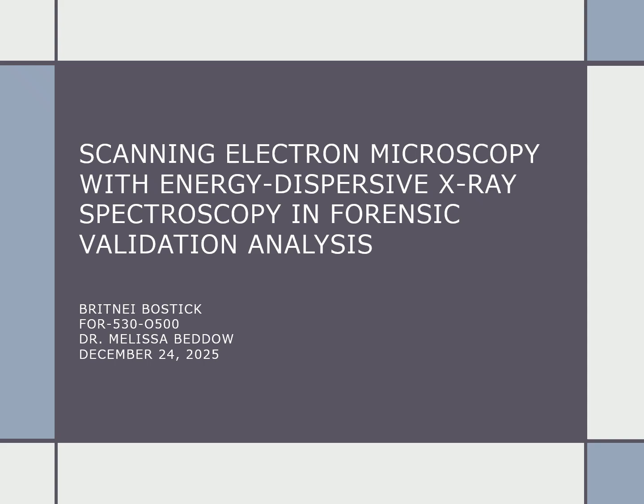Thank you for joining me as I present on the use of scanning electron microscopy with energy dispersive X-ray spectroscopy, or SEM-EDX, and forensic validation analysis. SEM-EDX is a combined analytical system that allows forensic laboratories to examine microscopic materials while simultaneously determining their elemental composition. In this presentation, I will cover how SEM-EDX works, why it is useful in forensic casework, and the results of a validation study.